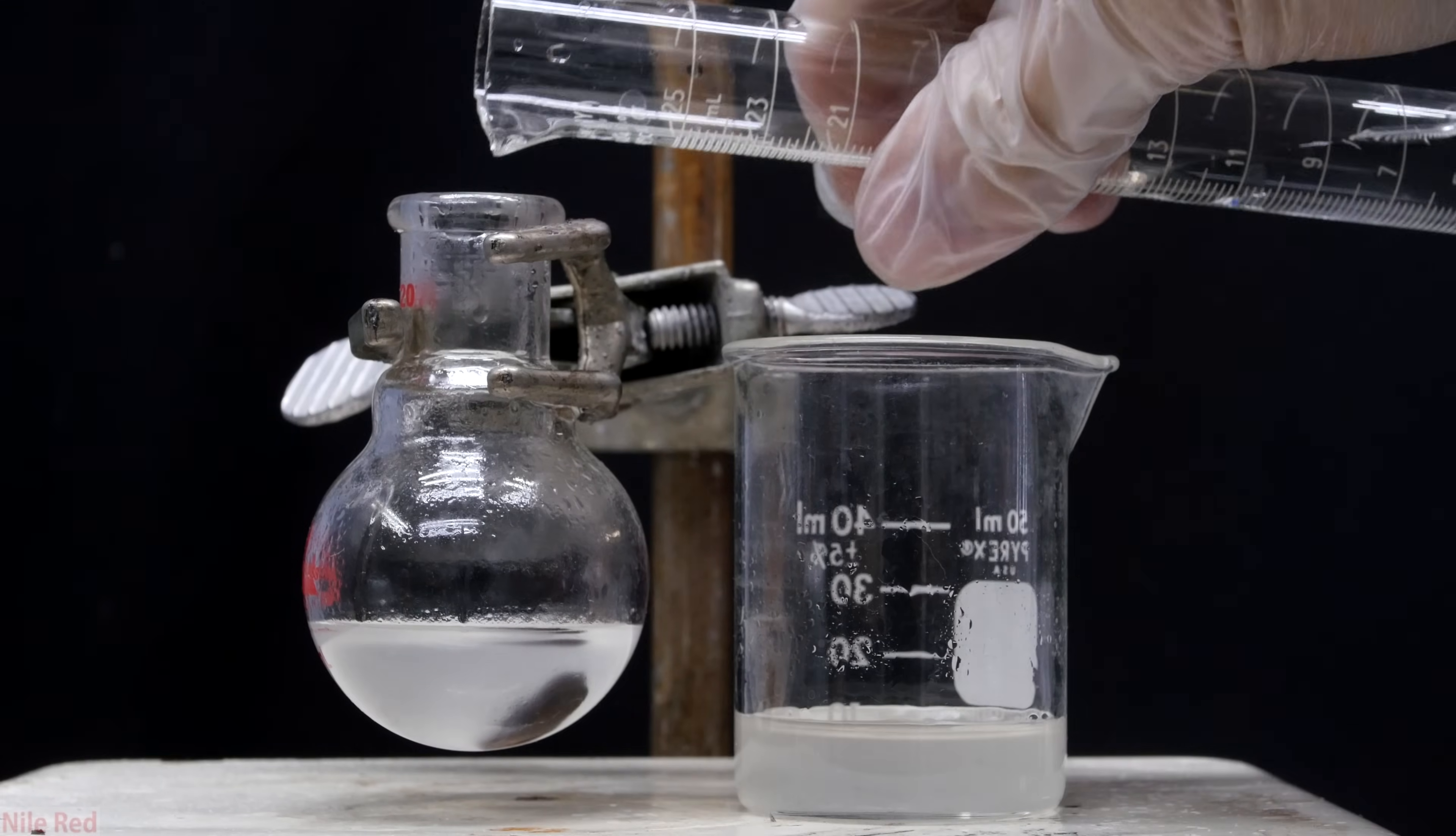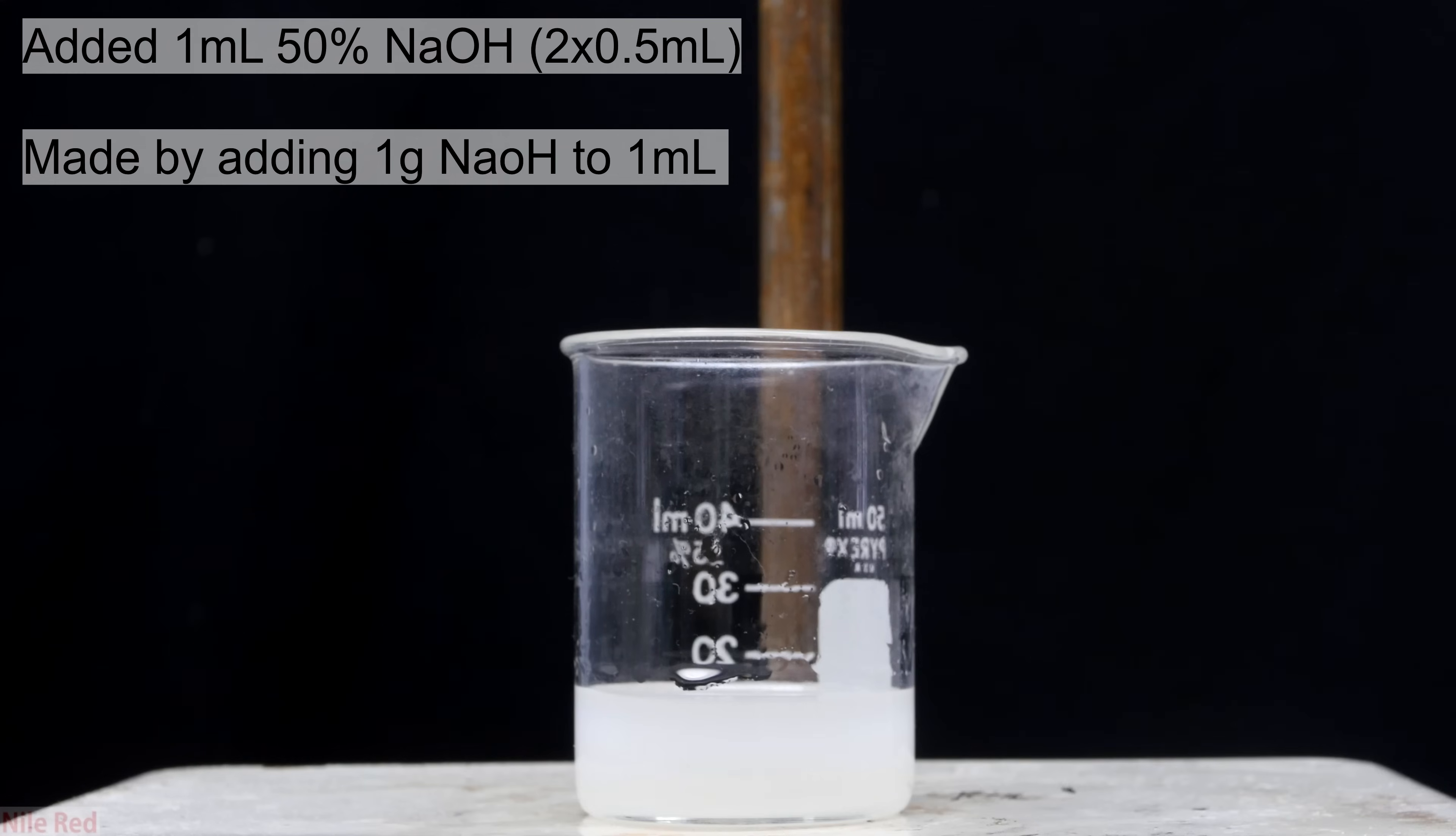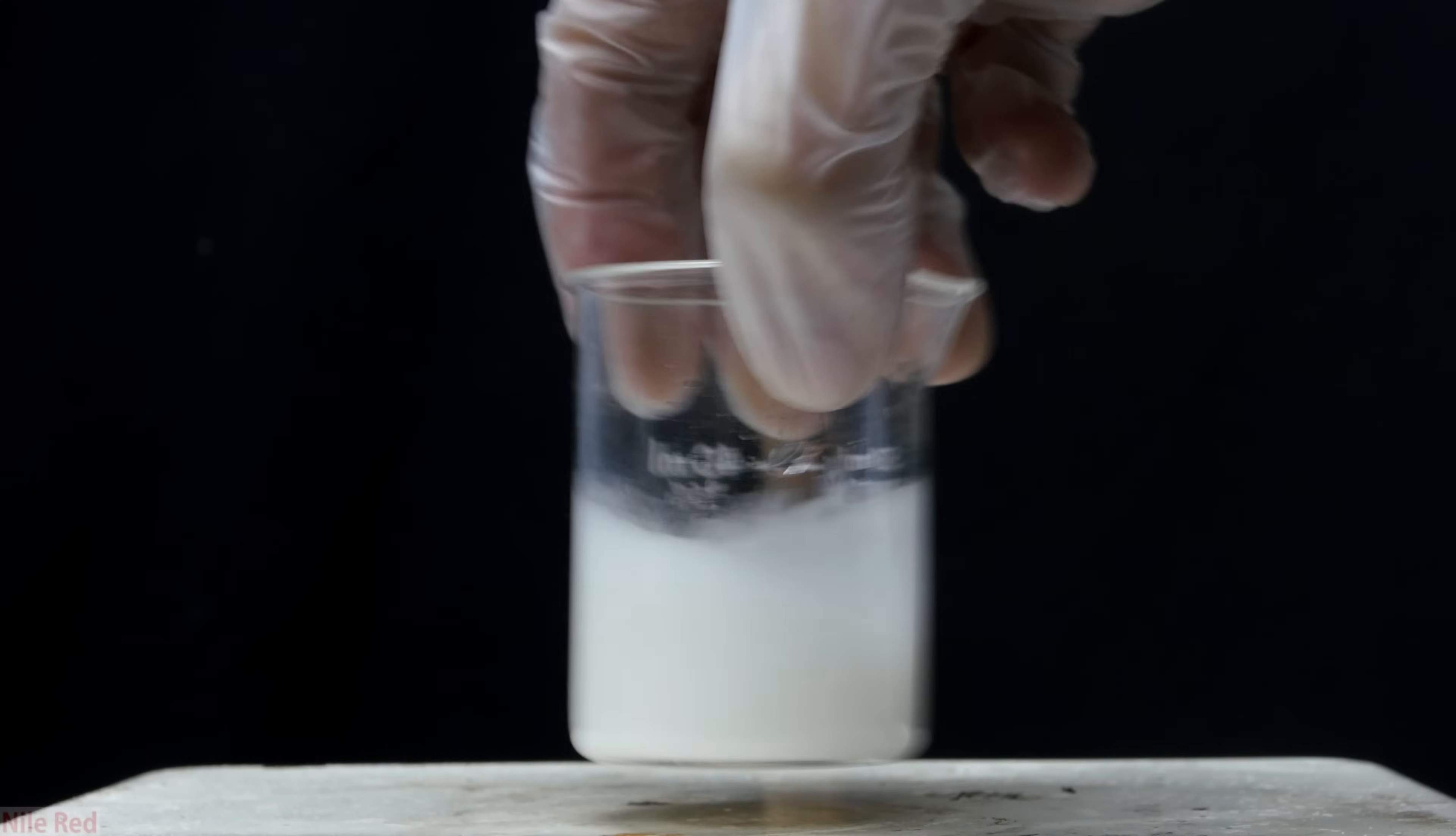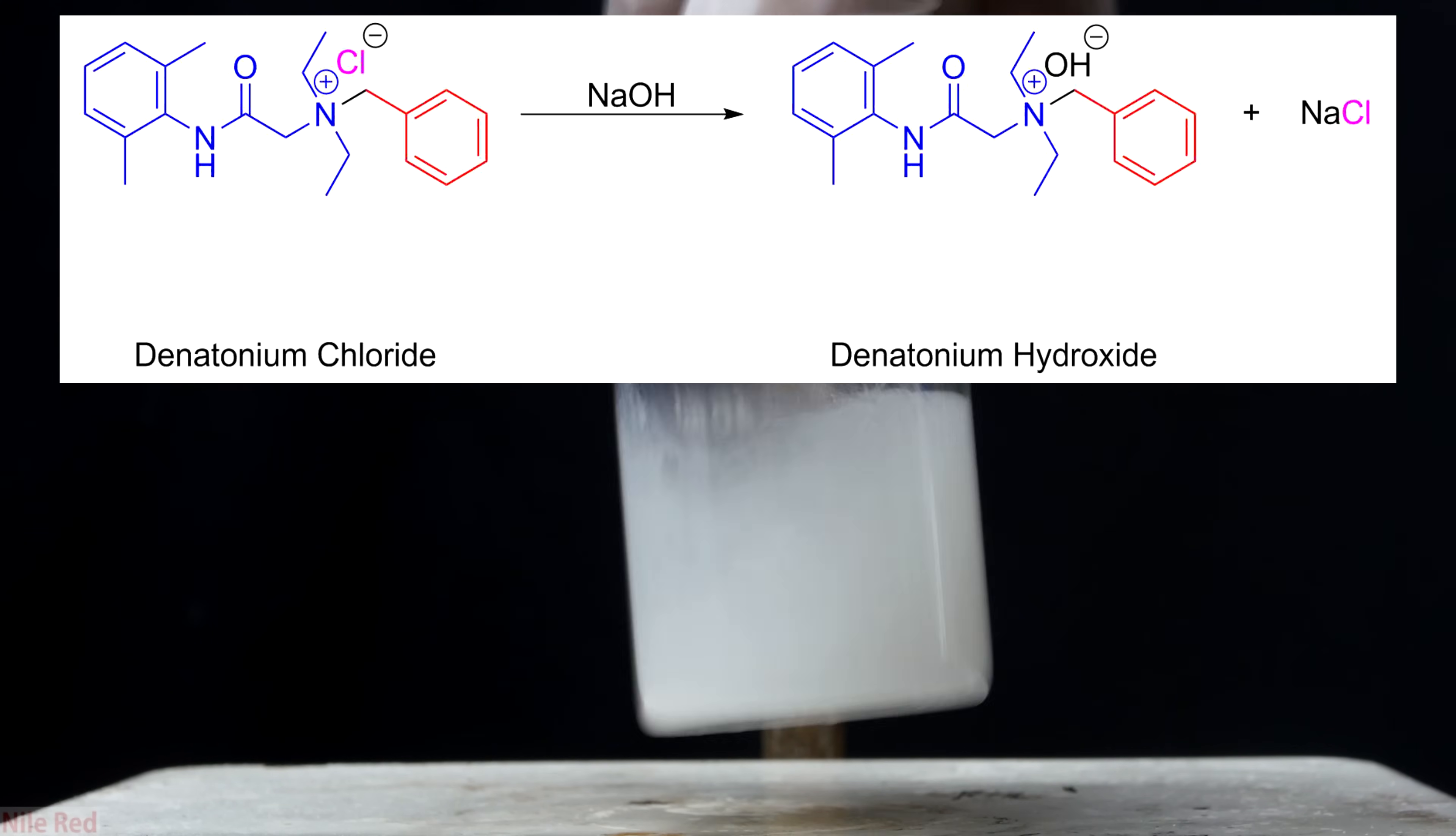The toluene layer in the round bottom flask was still a little bit cloudy, so I decided to wash it with a bit of water. After mixing it and letting the layers settle, the water was also transferred to the beaker. So now to our denatonium chloride is added about one milliliter of 50% sodium hydroxide. I added the sodium hydroxide solution in two portions of about half a mil each time. This can be made really easily by adding about one gram of sodium hydroxide to about one milliliter of water. It might be hard to see, but a little bit of white solid precipitated out. This white solid should be denatonium hydroxide.